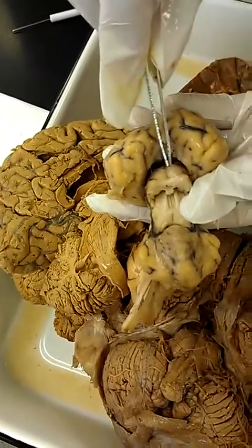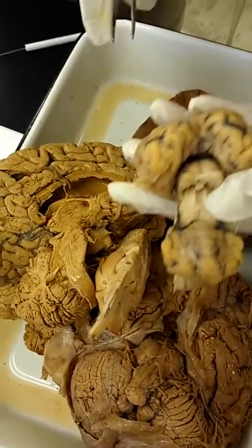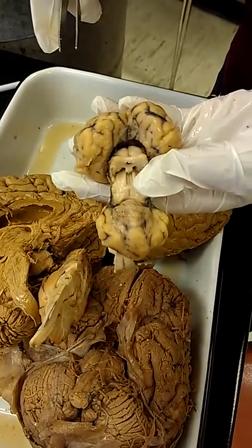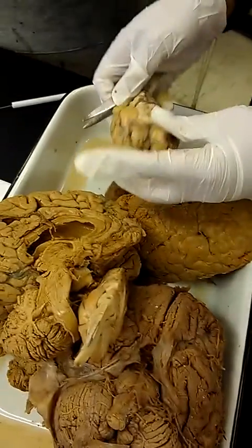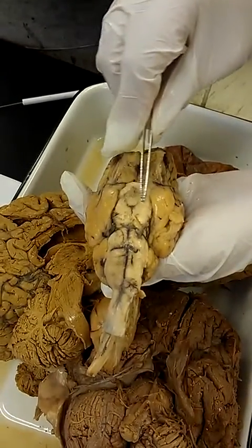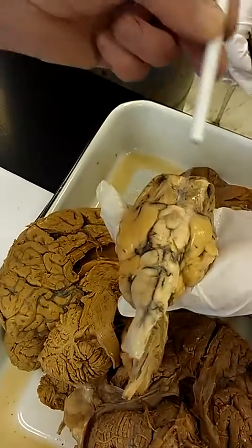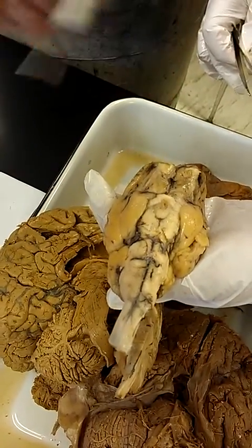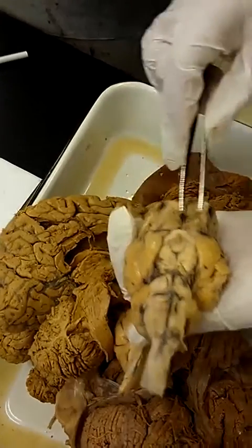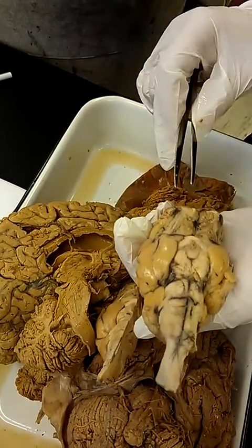Mr. Steiner, where can you point out the cerebral peduncles? You got the wrong side of the brain. It's under the brain. It's underneath. It's this portion right here, right? Well, yes and no. It's this thing right here. It's this and this. So just this part is the cerebral peduncles. Just these two lobey-looking fleshy lobes? Yeah, just these two.